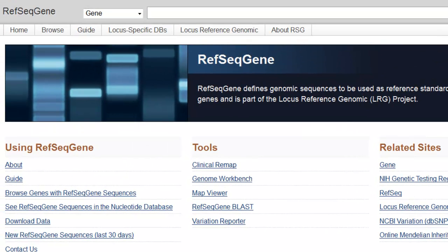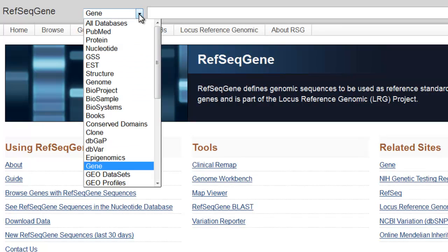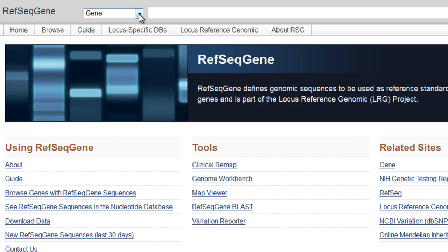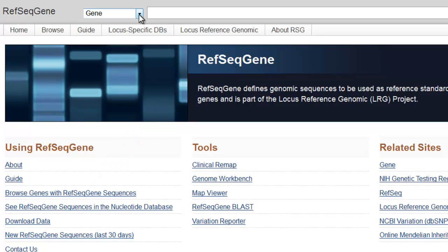You see the standard NCBI query bar at the top of the page. This is provided for navigation to other resources at NCBI, not to search RefSeqGene. Instead, use the link Browse Genes with RefSeqGene sequences, or link to the RefSeqGene records in the nucleotide database.